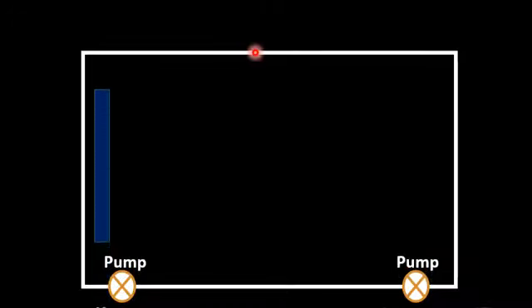This rectangular shape represents the Auger electron spectroscope chamber, whereas the circular ones represent the ultra high vacuum pumps which are attached to the Auger electron chamber. Inside the Auger electron chamber there is a sample holder, which is a specimen holder.